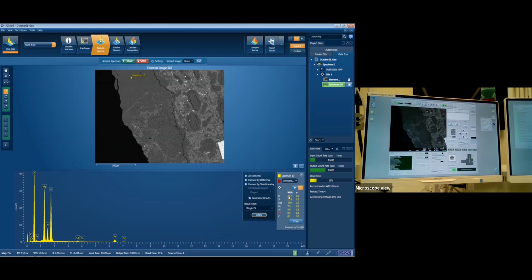So it's a rock. Lots of rocks are pretty much made out of silicate minerals. That means we're always going to see lots of silica and lots of oxygen. Everything else on top of that is kind of the interesting stuff that makes it different minerals. So in this one, we've got lots of magnesium, a little bit of iron, a fair bit of aluminium, but not very much calcium, and that little carbon peak at the end is probably just the carbon coat we put on top of it. The EDS itself is very quick, as you can see.